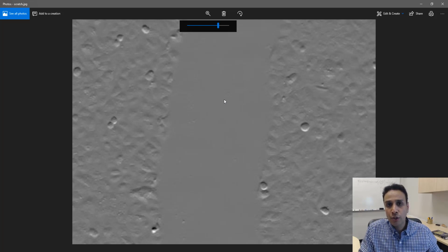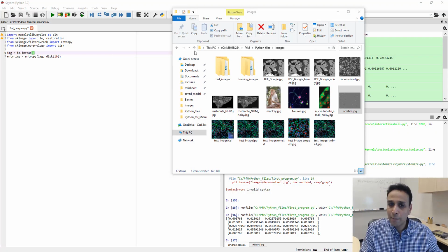You cannot use grayscale histogram-based segmentation here because this area has the same mean gray level as the rest of this image. So this is really a tough image processing challenge where you have to use texture filters. Entropy is one of those to segment these two regions.